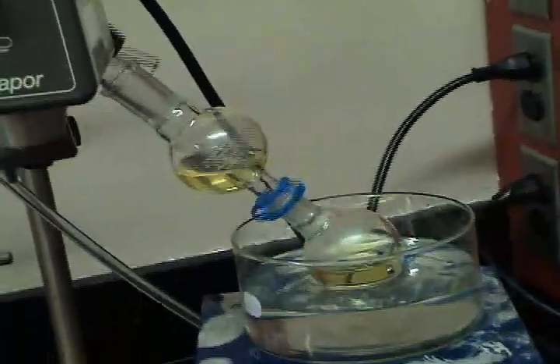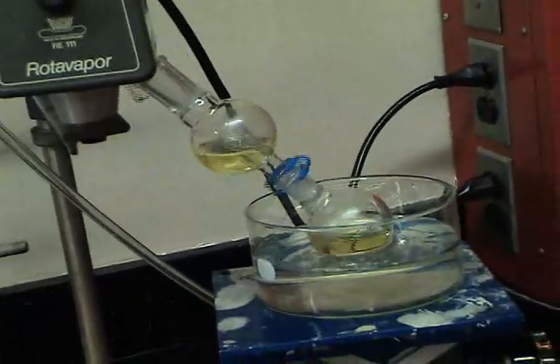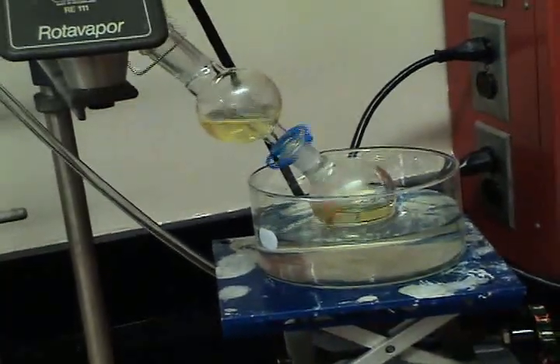Anyway, what I was saying is, the reason that it is spinning is to increase the surface area of the liquid on the sides of the flask.